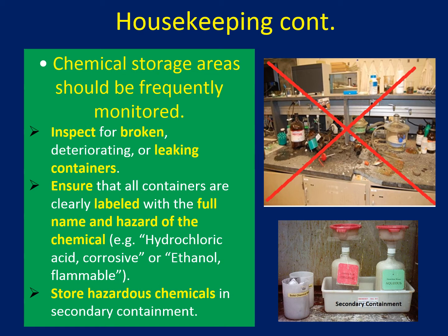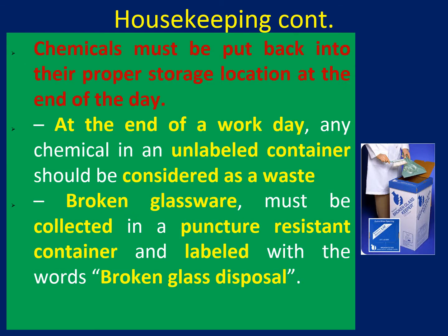Store hazardous chemicals in secondary containment, and also chemicals must be put back to their proper storage location after the experiments, right, at the end of the day, because you have to label these chemicals, and otherwise the technical officers will consider them as waste, and it is even dangerous for them because they don't know what kind of chemicals are inside. Please make sure to label all the chemicals you use during the experiment, right?